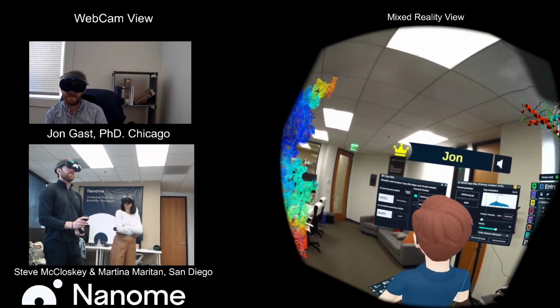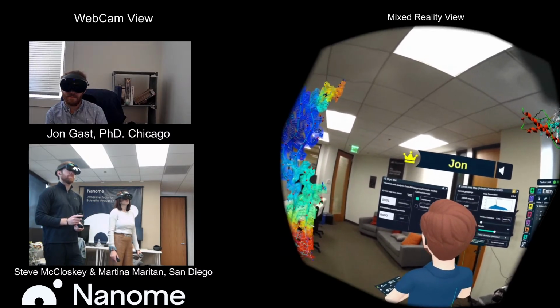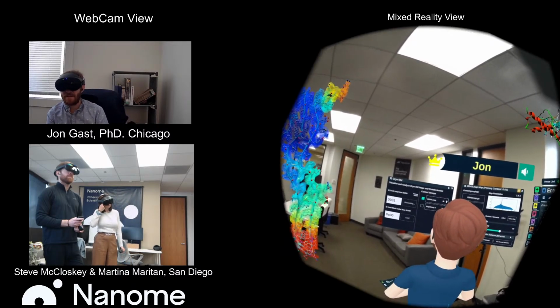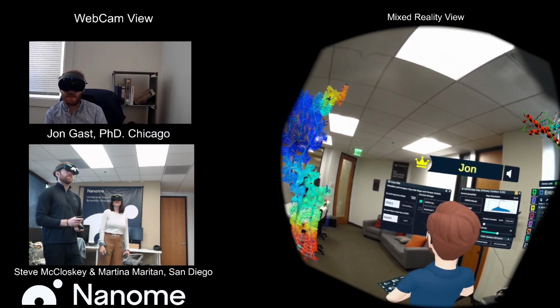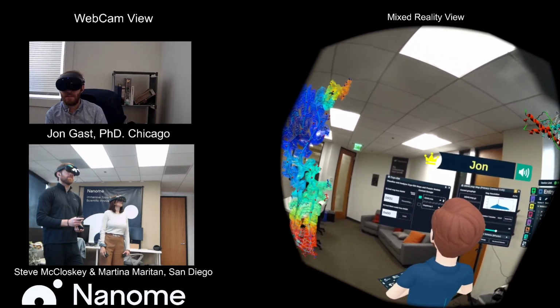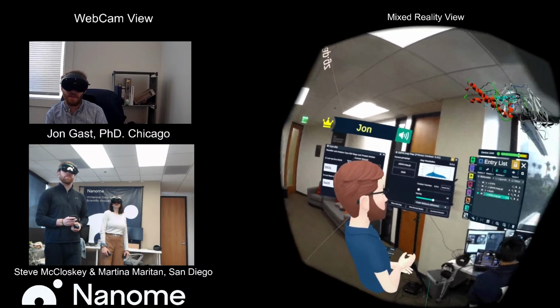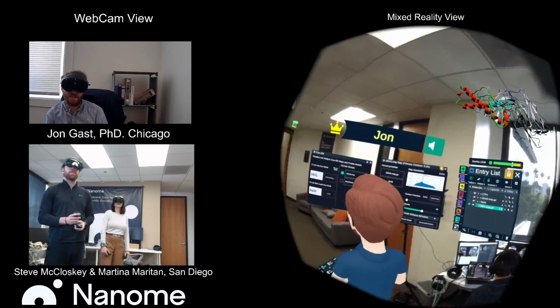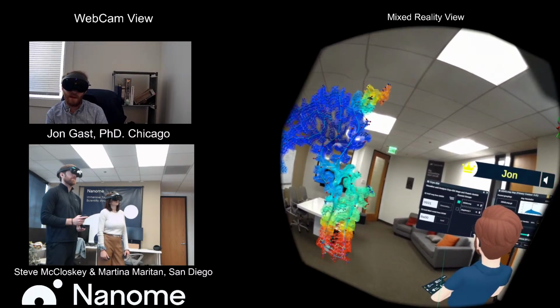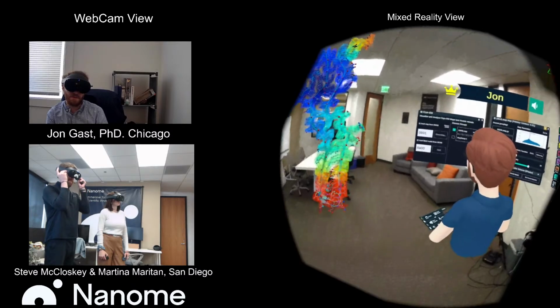Sure. So next question is, can the plugin be used to perform any post-processing of the maps, like denoising or sharpening? No, not currently. That's something that typically you would want to do outside, but you can always bring them in. Right now we only support maps that are already submitted, so that should be noted. But being able to bring in your own maps and look at them at each of those states is something that we're hoping to make possible in the near future.